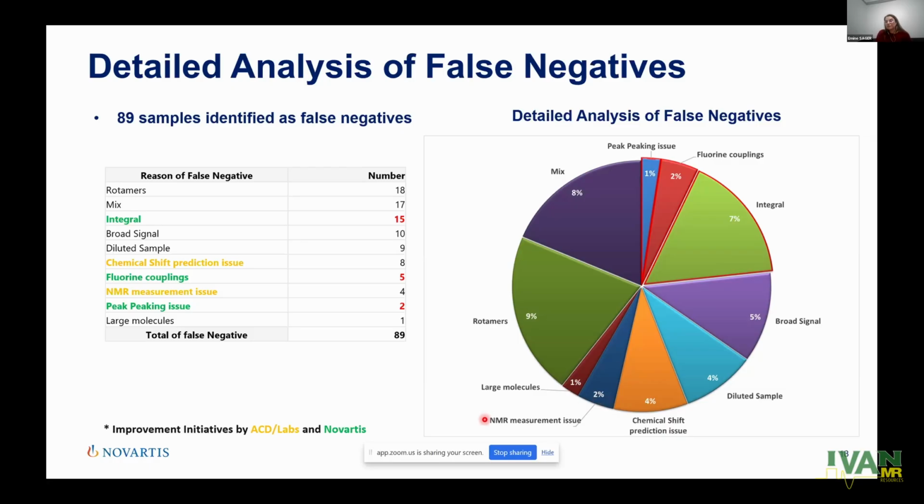And here, what happened, the NMR issue, what I put in NMR issue, we are using lab to lab, but sometimes it happens that you have a bubble in the middle and the shim will be very bad. You end up with a bad spectrum quality. So this will arrive, you will have a bad ESV. But this is only 2%.